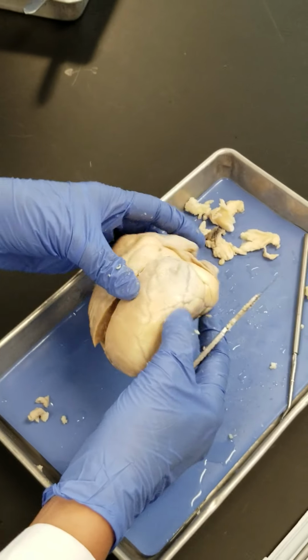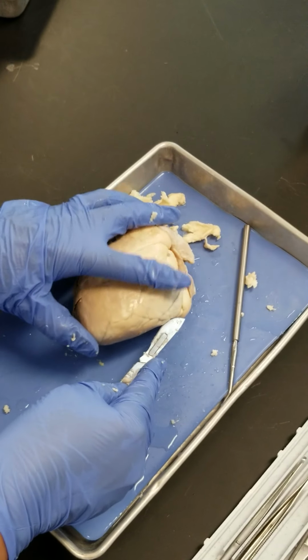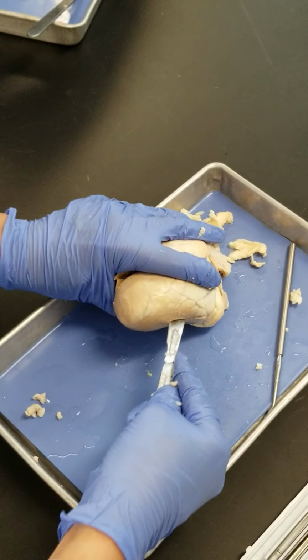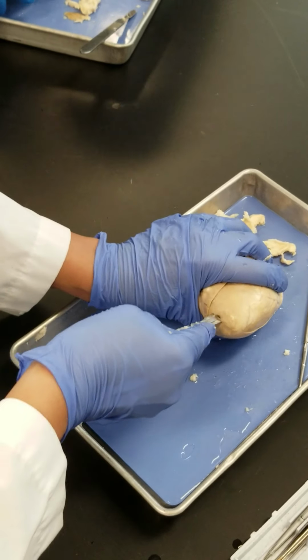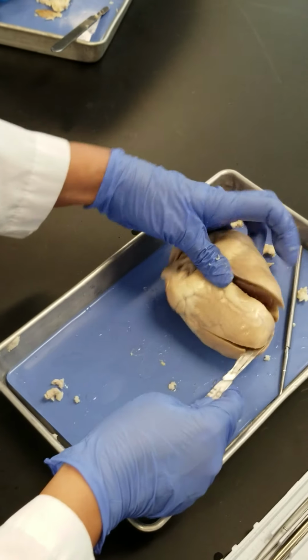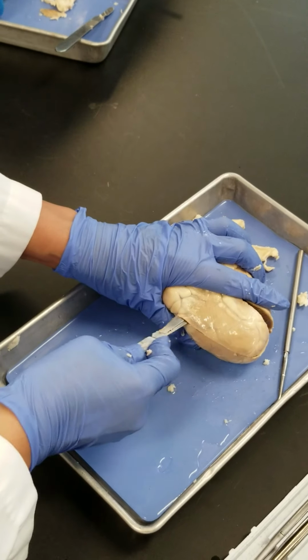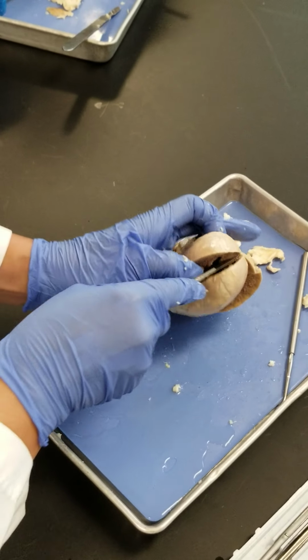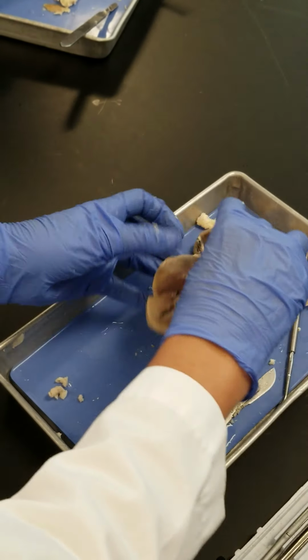If I cut the left ventricle too, just the right ventricle, in the frontal or coronal plane, like this one, right? We cut the left ventricle too to get it here. Yeah, the right one. Along the same as that. Even that little bit I think right here is actually a lot of fat. Oh, yeah. You're right. That makes sense. Now that explains it.